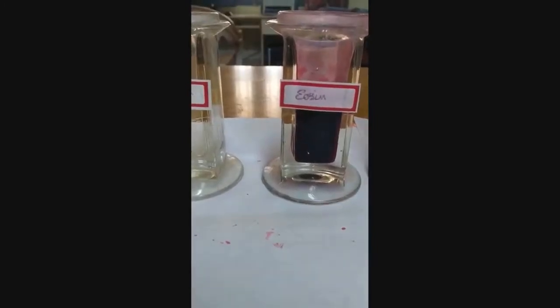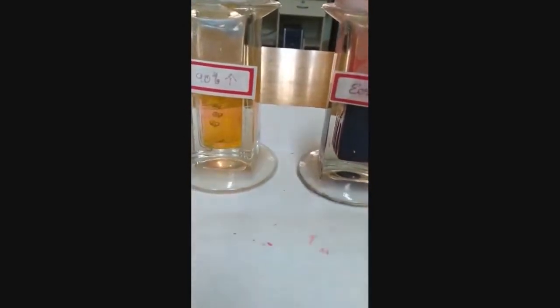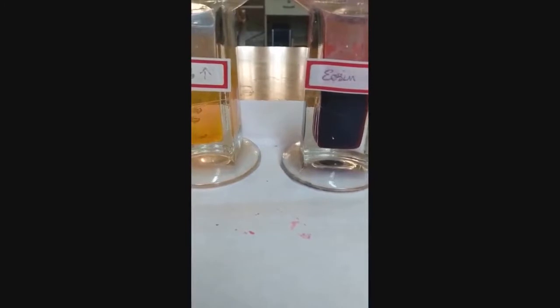After about 5 minutes, remove the slide from eosin and dip it in 90% alcohol for about 2 minutes. This is to remove the excess stain. The process of staining a tissue with 2 different stains, that is a nuclear stain and a cytoplasmic stain, is called as double staining.